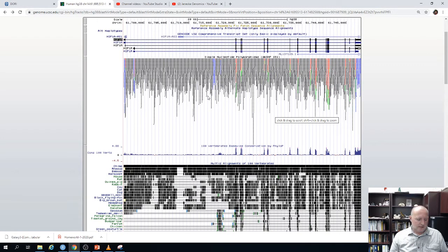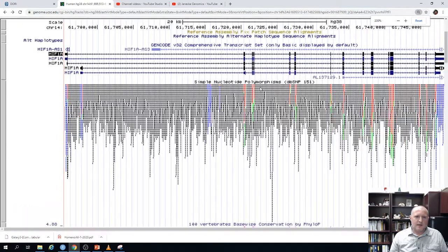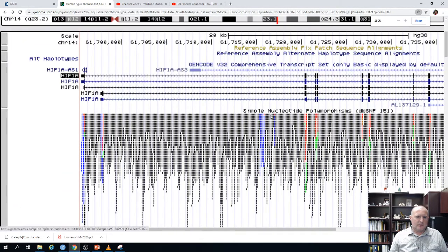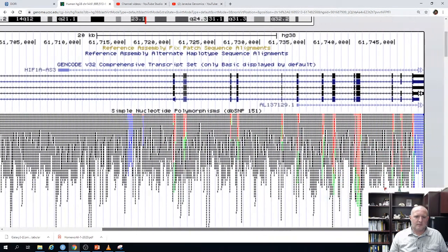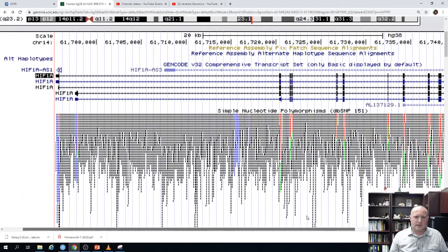If we zoom in a little bit more, we can start seeing some patterns. The SNP variants are pretty randomly distributed — they're both in exons and introns. It seems there are more non-synonymous SNPs than synonymous SNPs.